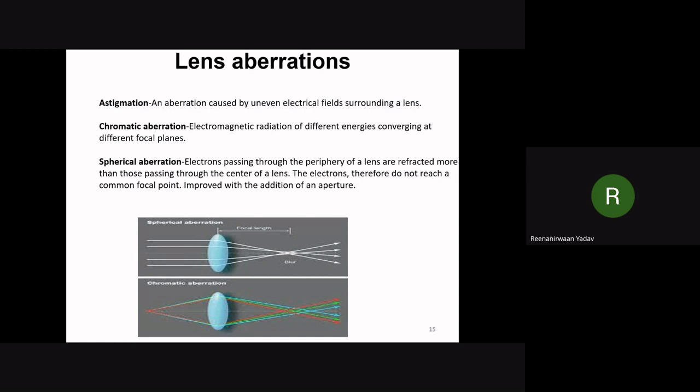Although the electron source that we are using is coherent, both spatially and temporally, after interaction, or due to some poor vacuum or other things, we get chromatic aberration, because the electrons which lose energy disperse more and focus earlier than our focal plane.